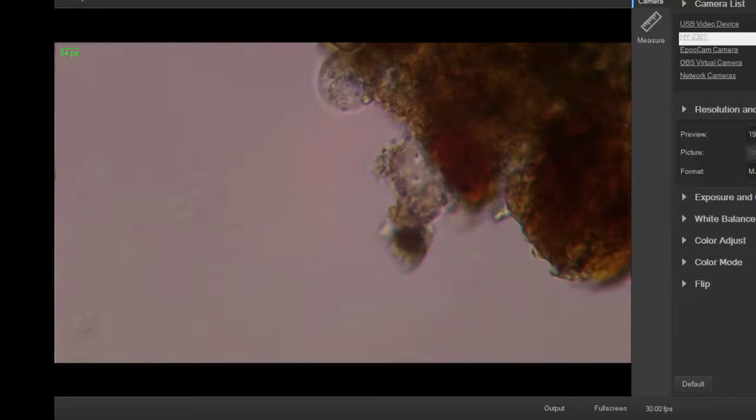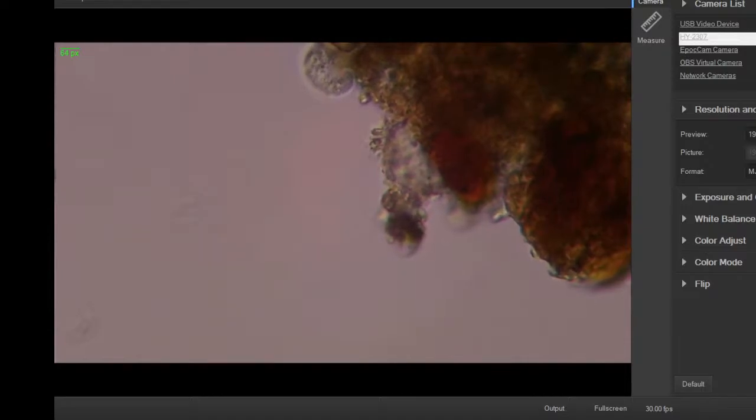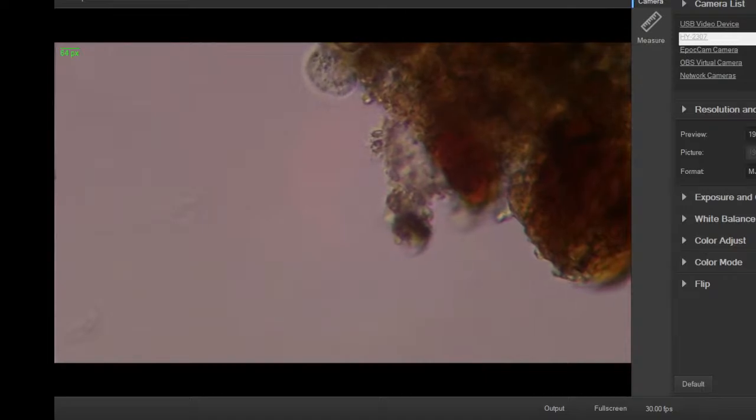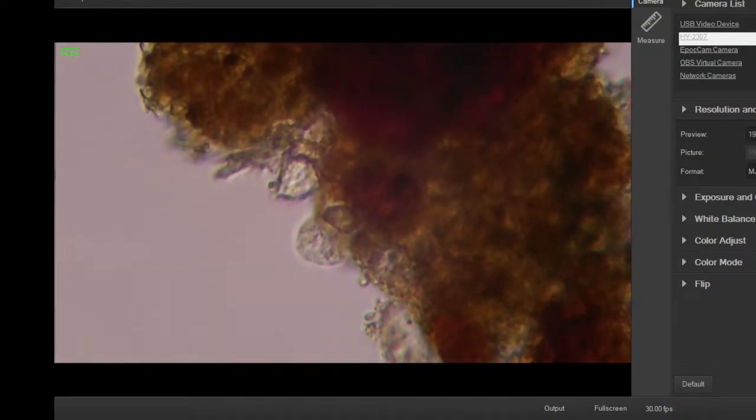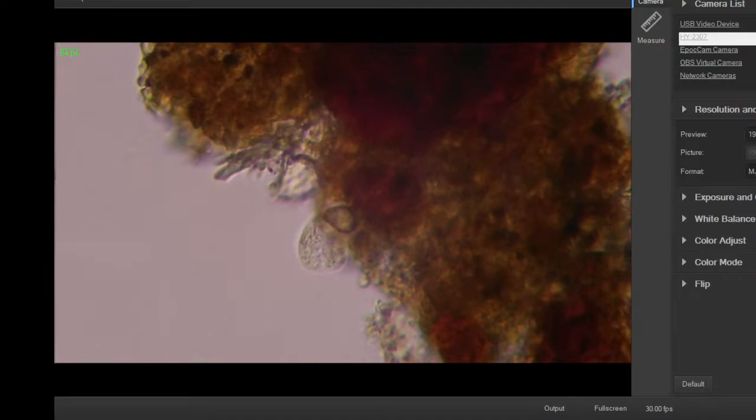Of grass that were wet and some leafy material nearby. Come on, man. Get out of the tube. This might be fun just to see. I'm tempted to do an oil immersion and get 1,000 power in this guy because it's so still. I think I will. I'll have to clean the optics, but sometimes it's worth it.